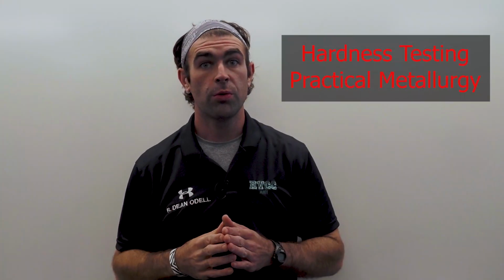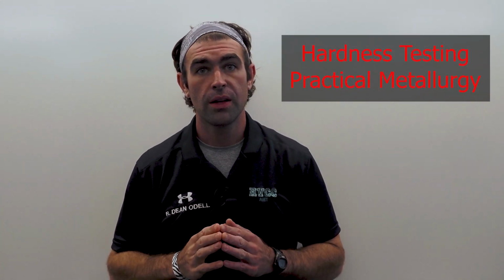I'm going to do an overview of hardness testing. So this is the first virtual lab we're going to do. I'm going to do several different hardness testing methods, but I just want to talk about what it is and why we do it. So the hardness of a material is the resistance of that material to penetration. So we measure it by penetrating the material with what's called an indenter or a penetrator, okay?